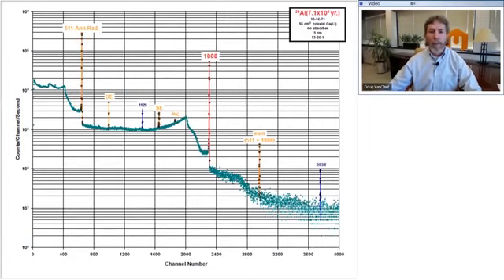And finally, we will talk for just a moment about summing. Here, we show an obvious example of summing with 2 prominent collections of observations at 511 and 1808 keV, which sum to 2319 keV. But what about the 2938 keV observation? Is that a sum peak or a regular gamma decay peak? The answer is yes, it is both.